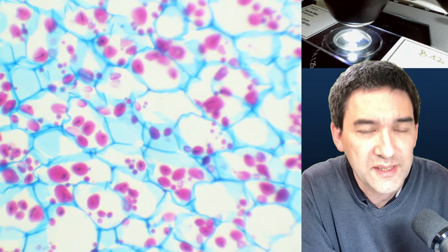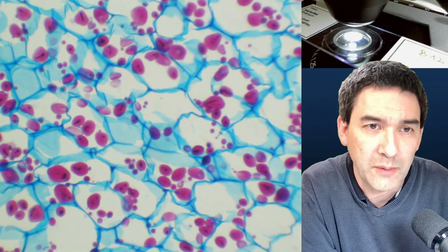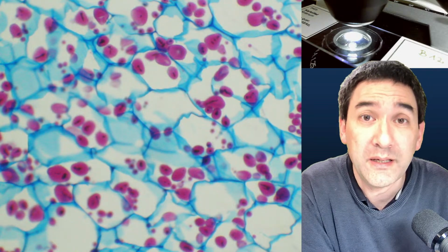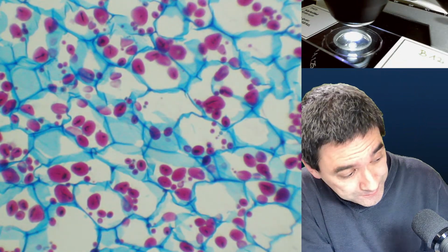Okay, so you see that the cell wall is stained blue. I don't know which blue they used, methylene blue. And the starch grains are purple, pink. Okay, so this is a stained specimen.